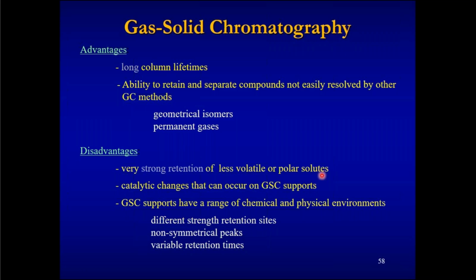So these types of compounds are very difficult to elute. Catalytic changes can also occur on the GSC support, because adsorbents may undergo certain changes because of catalytic reactions.